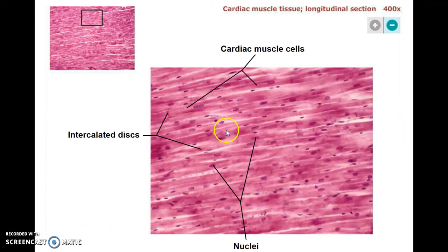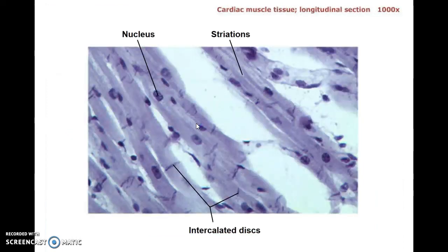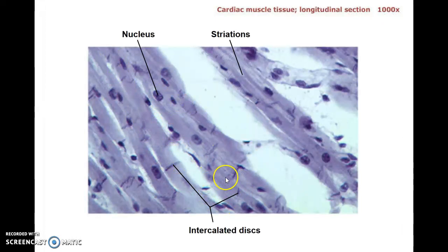Here you're looking at cardiac muscle cells. They're much smaller, usually with just one or two nuclei. They do have striations, though you don't see them that well, and they have these intercalated discs, which we'll see much better in subsequent slides. The cells are running across the slide, and you can see where the cells touch or connect — they have those nice intercalated discs that help carry action potentials from one cell to the next, so they all beat or contract in unison.